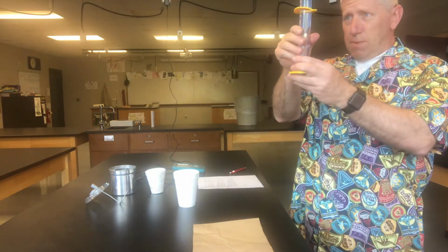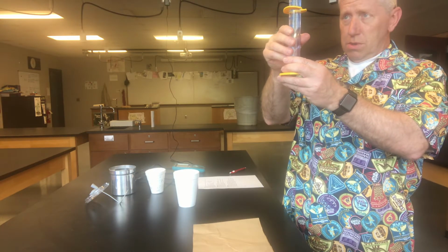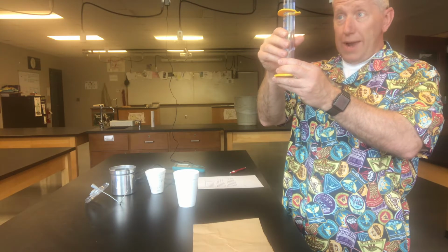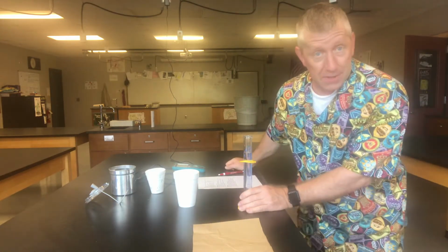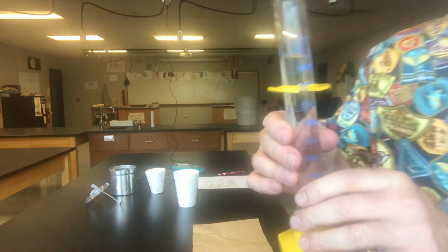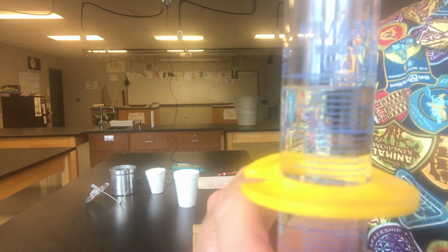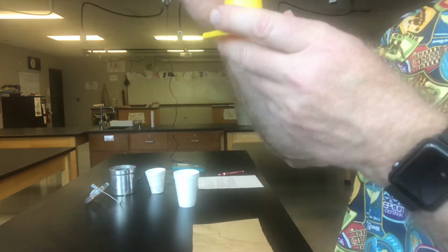And let's just double check that one more time. 98, 1, 2, that's 96, 97. No, 97.8, see? Good thing I double checked. Oh, I did write that down. I did write 97.8. I'm losing it here. And I had coffee too, that's the scary part. Just triple checked it, 97.8. You check it, lab partner. Okay, good. You concur. 97.8 it is.